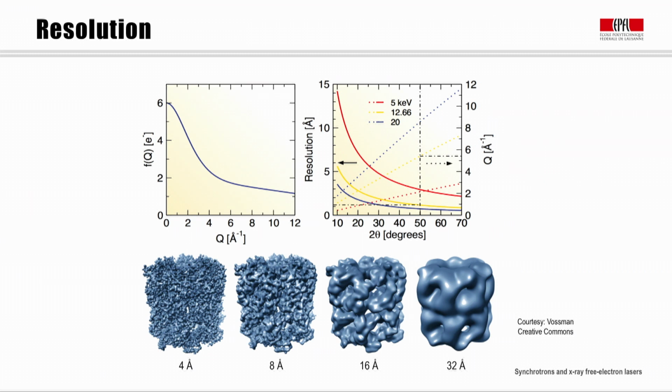However, at 5.4 reciprocal angstroms, the atomic form factor is less than 2 electrons. Now remember that the scattering intensity scales with the square of F, and hence the trade-off we have to accept for increasing the resolution is a reduction in intensity at the edges of the detector by more than a factor of 4. Hence, the experimentalist must consider what resolution is necessary to obtain a full structural model. There are several complementary methods to assist in this enterprise, such as molecular replacement, described in more detail later in the course.